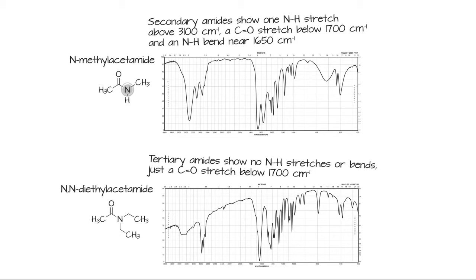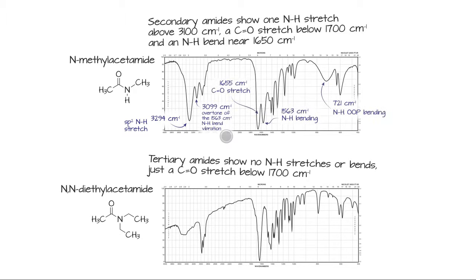Now, here is a substituted amide. Notice only one NH peak. Still, again, fairly strong. So that could be a secondary amine, or it could be a substituted amide. Since it's so strong, I'm thinking substituted amide. And of course, boom, there's the CO stretch again on the low side.